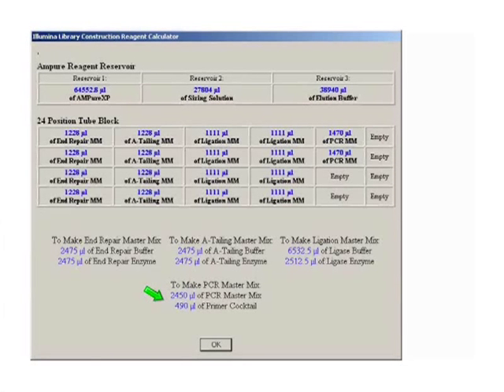And then finally, I think for these automation solutions, when we compare library performance, meaning we don't look at things like library yield at any intervening steps or anything else, if we simply take the same sample and put it through our scheme as well as Beckman's, and then put it on a sequencer and look at things such as library complexity, alignment performance, consistency with known sequence data, et cetera, the libraries we've generated on the SPRIWorks HT methodology using their reagents versus the reagents we use, when you get to the sequencing piece, are quite indistinguishable for genomic DNA samples.